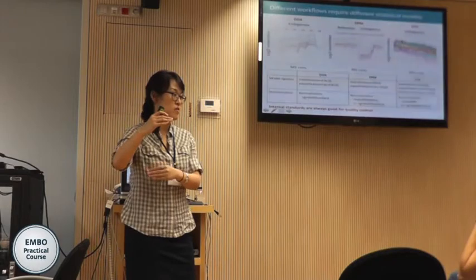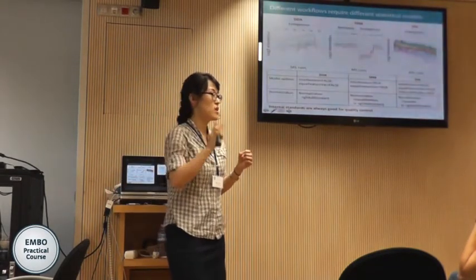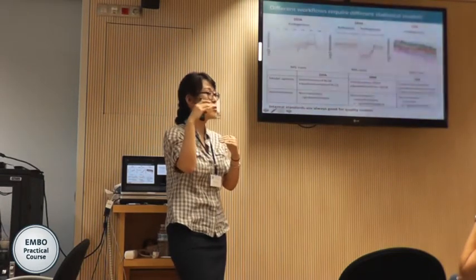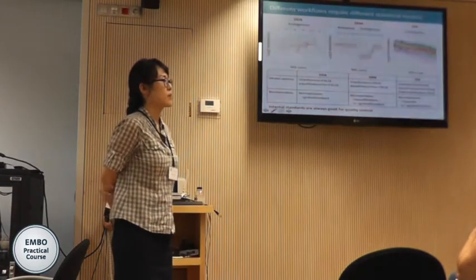And then there are some significantly different. Maybe you can just go again and then just use the false. Yes, so it doesn't matter depending on the protein. If they are equally weighted, it doesn't change this. Yes. But the danger is that you can overfit a little bit.